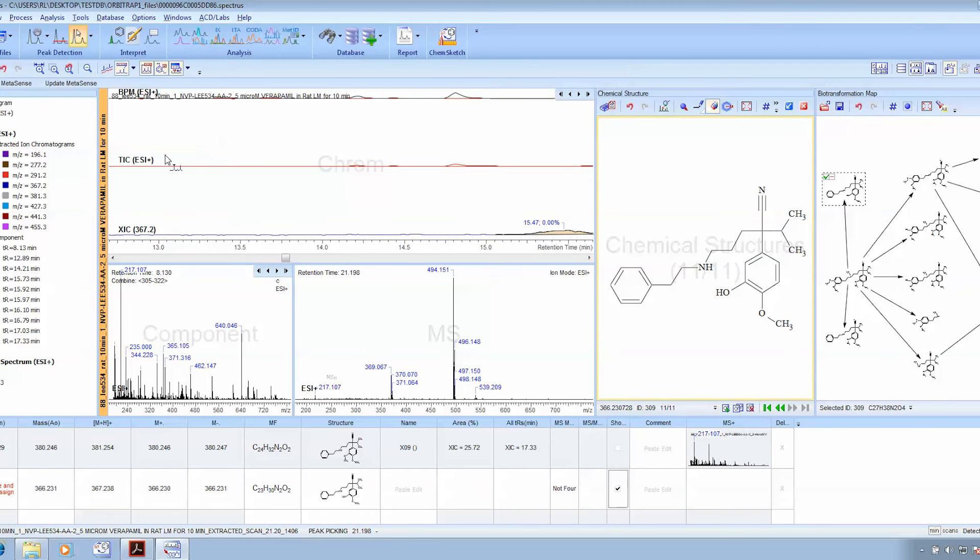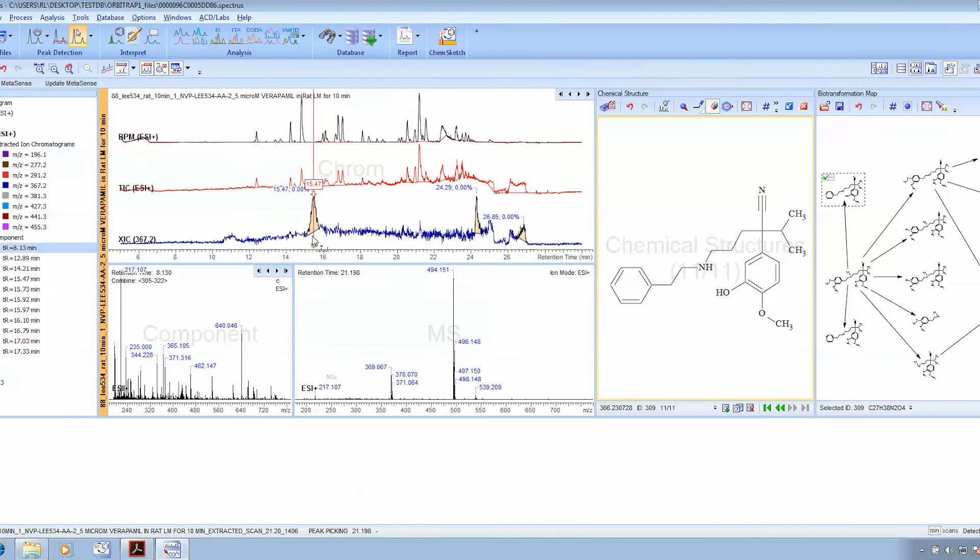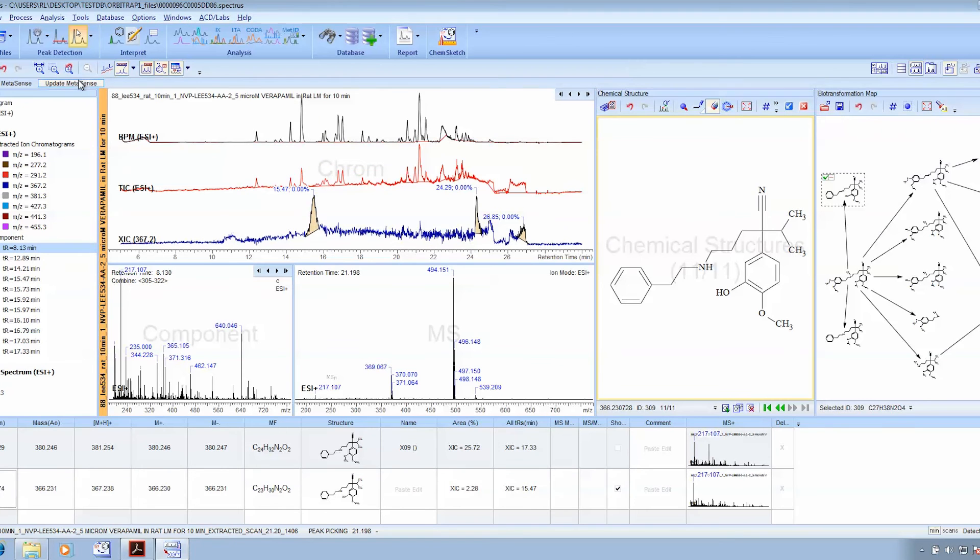If you were looking at a complete study, once you simply click on Update MetaSense, it will look for that added metabolite across the entire study that you've just processed.